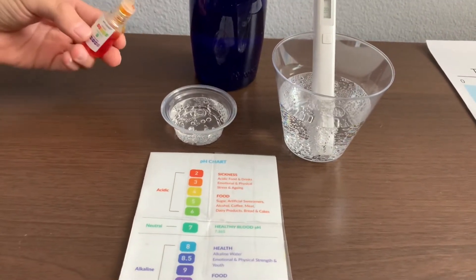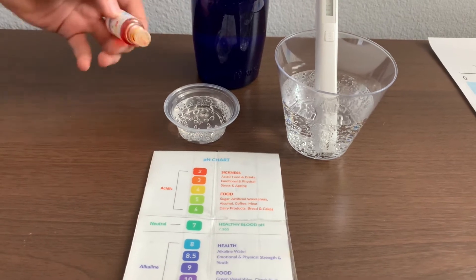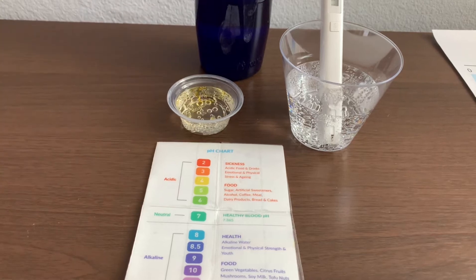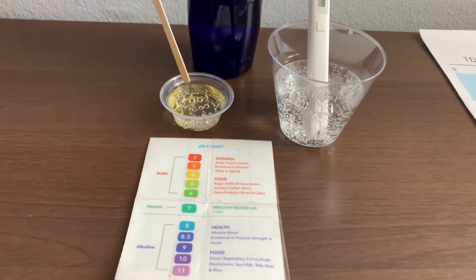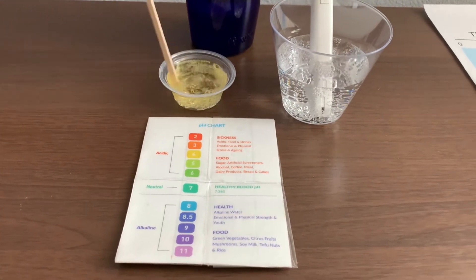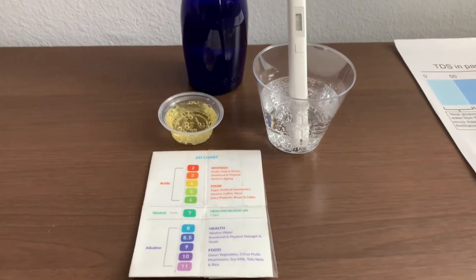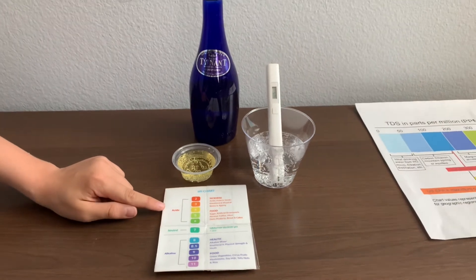Now, let's test the pH level. You can do two to three drops. Let's stir it all for a better result. I give this a four — this is acidic.